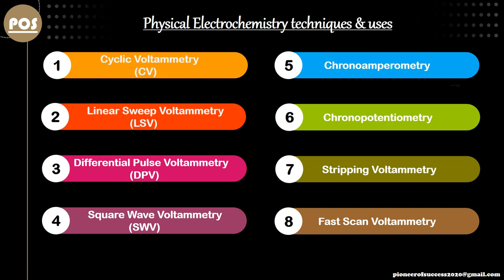We are conducting the series Electrochemistry for Researchers and Engineers. We have already spoken about fundamentals of electrochemistry, details of cyclic voltammetry, and also details of different electrodes that are used in electrochemical experiments. Here we are talking about different kinds of voltammetry and why they are used. Different kinds of voltammetries are used in different electrochemical experiments covering multiple fields such as electrochemical sensors, energy storage devices, and other related fields.